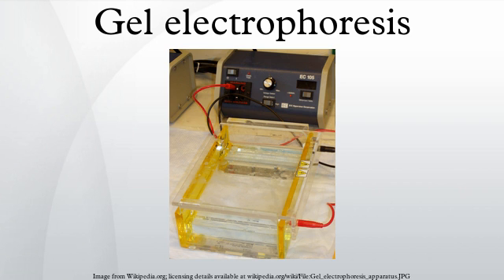Downstream processing. After separation, an additional separation method may then be used, such as isoelectric focusing or SDS-PAGE. The gel will then be physically cut, and the protein complex is extracted from each portion separately. Each extract may then be analyzed, such as by peptide mass fingerprinting or de novo sequencing after in-gel digestion. This can provide a great deal of information about the identities of the proteins in a complex.